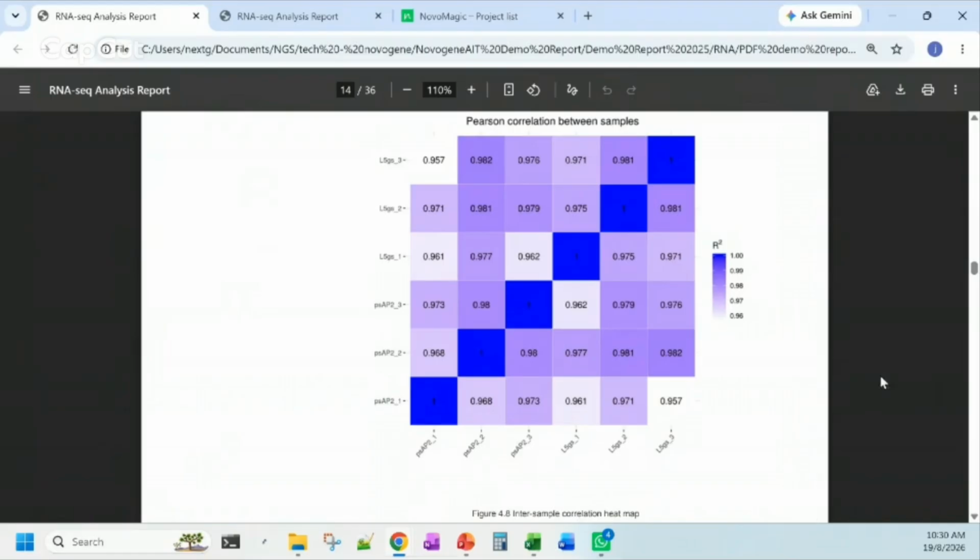If we have a lot of samples, normally we will try to see whether the samples of the same group have similar expression patterns, or whether the replicates are all close to each other. If we find certain samples have an expression profile that is very different from other samples, even the replicates from the same group, then we might consider whether that one belongs to the sample outliers.